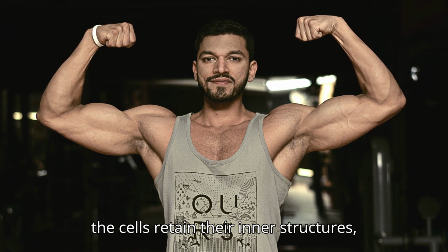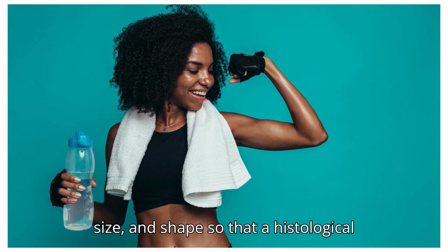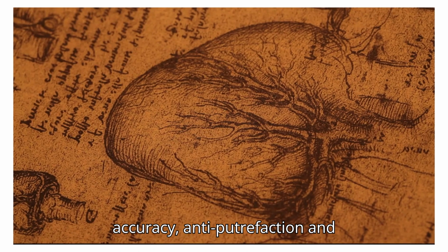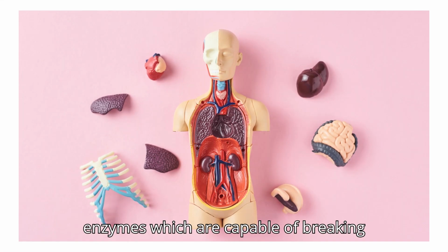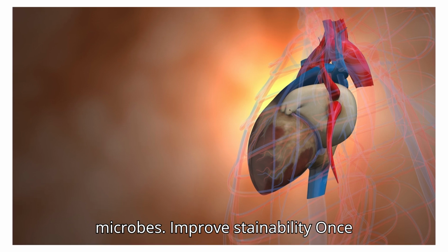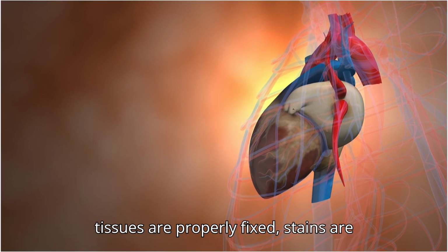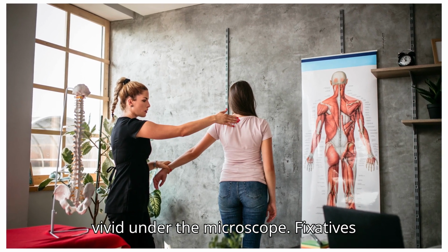Fixation ensures that the cells retain their inner structures, size, and shape so that a histological examination may be carried out with accuracy. Anti-putrefaction and anti-autolysis: fixatives inhibit those enzymes which are capable of breaking down cells and check the proliferation of microbes. Improve stainability: once tissues are properly fixed, stains are taken up perfectly and appear very vivid under the microscope.